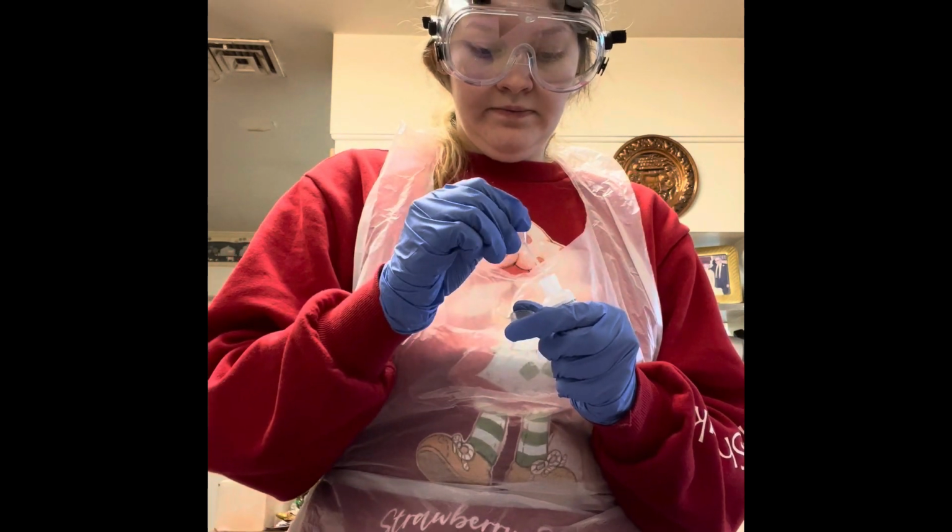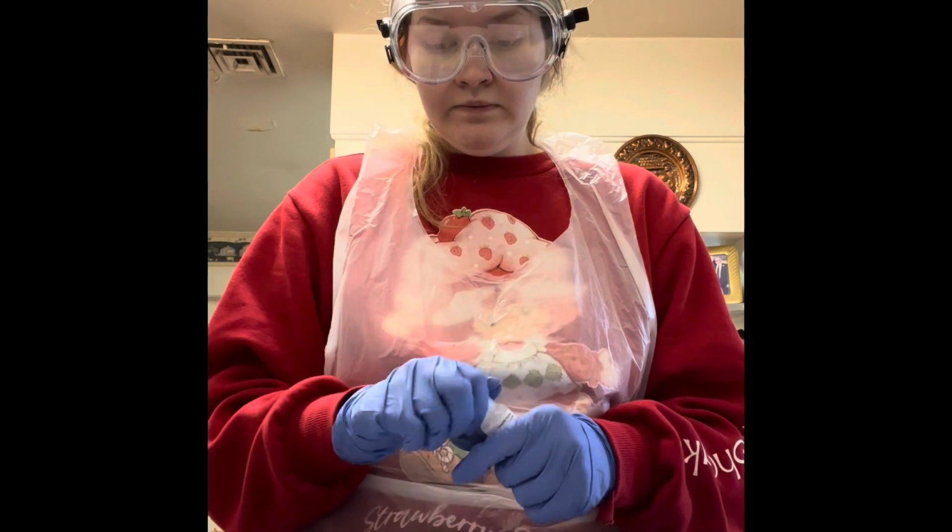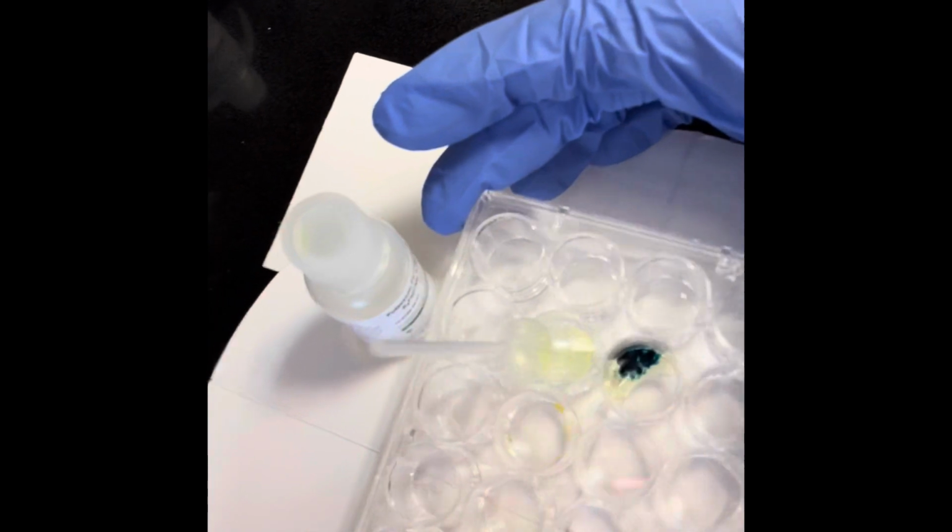Oh, wow. Immediate reaction. Immediate. I want you to see it because it's quite a pretty reaction going on. It's like a greenish blue, and it kind of has some flakes going on. So I wanted to add that it was 1 drop. That's all I needed for a reaction. And I also wanted to say that the color that it changed to was very interesting because it goes from a yellow to a brown with dark spots almost over time. So it's quite an interesting shift.